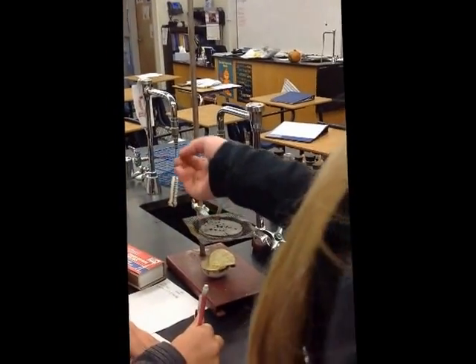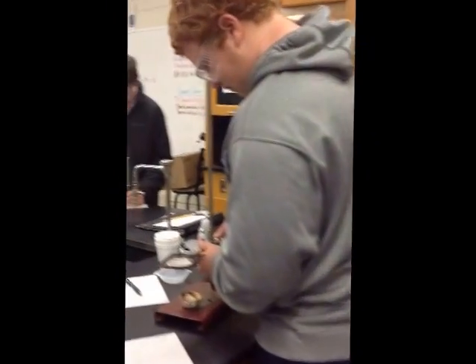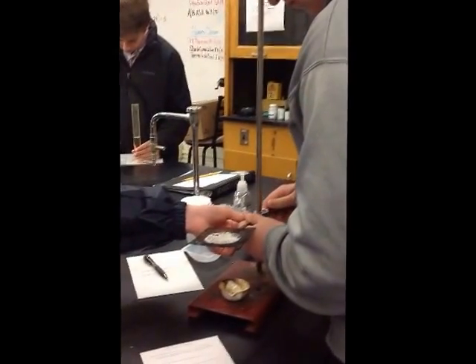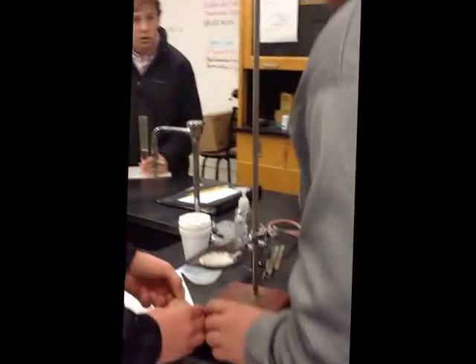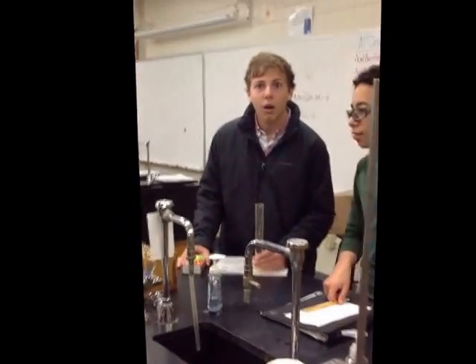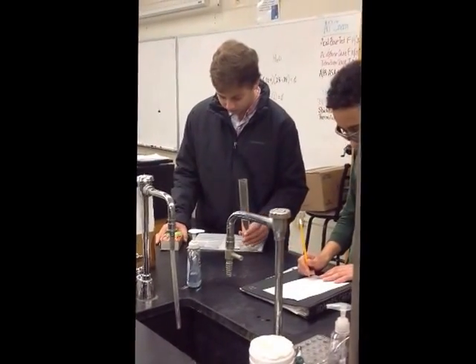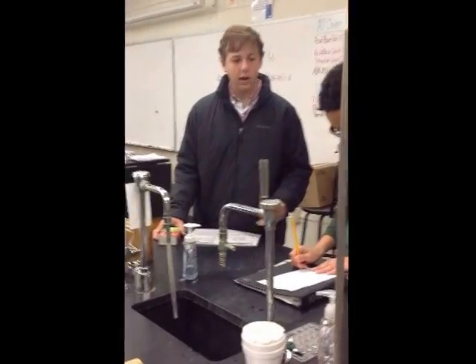Over at this lab station, they have their potato chip under their ring, and they've measured out their water. At this lab station, they're adjusting their ring to get it a certain distance above their potato chip. Also, notice Maddox is very carefully making sure that he gets an exact amount of water in his graduated cylinder. It's important to know how much water he has in order to carry out the lab.